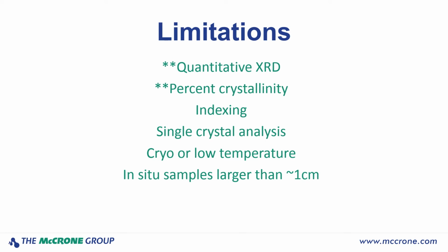Some other things we are not set up to do are determining the crystal structure of an unknown, and this is also known as indexing or single crystal analysis. We also do not have cryo or low temperature capabilities, which is more in tune with protein analysis, and we can't look at in situ samples that are very large.